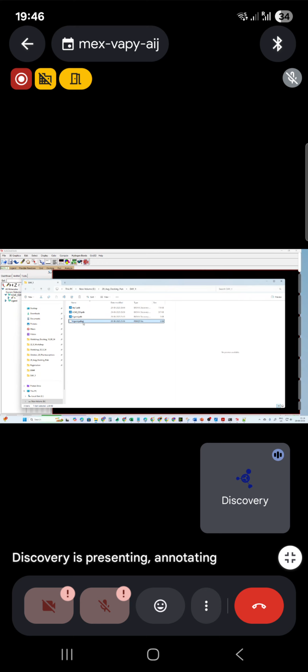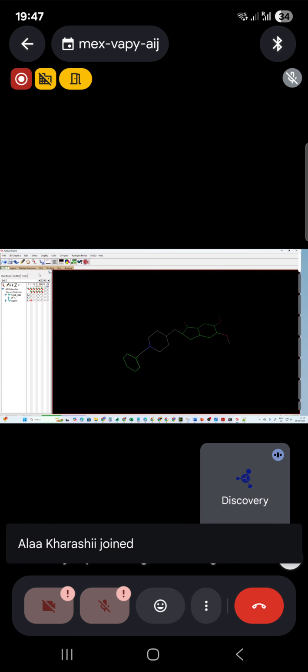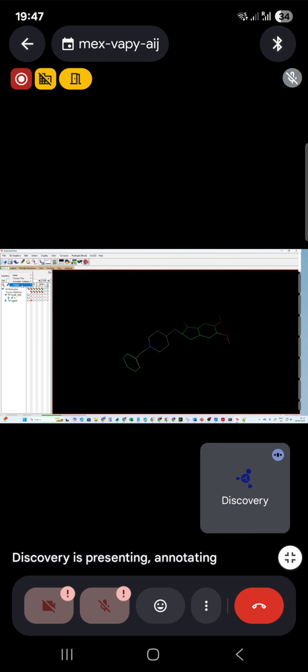Okay. So if you do not generate this PDBQT format and go through the steps further, you will create problems later on. Okay. So you have to go through this output and save as PDBQT.